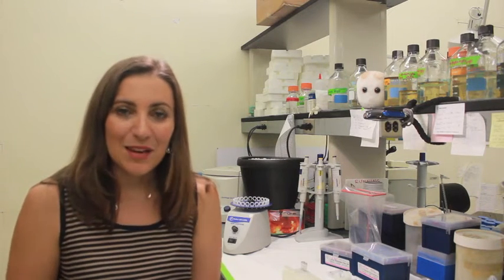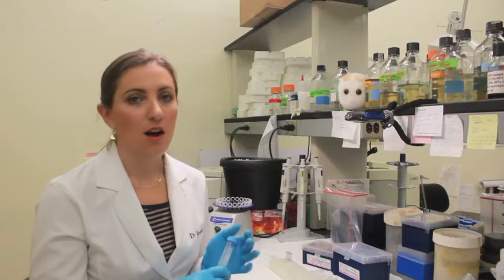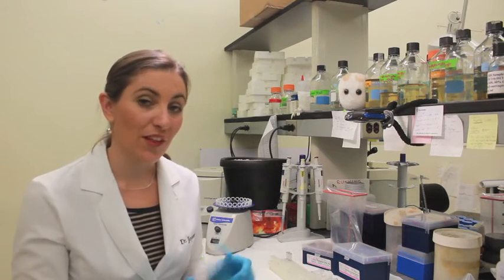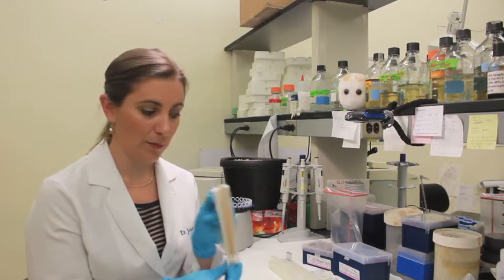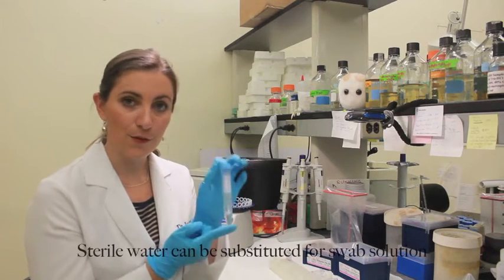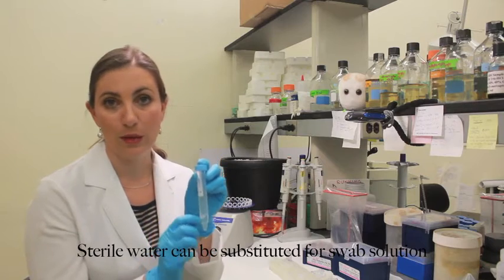So enjoy going out and sampling that urban microbiome. We are back and ready to sample our urban environment. For the sake of this video, we are going to sample the light switch behind me. Before we do that, we have our sterile swabs, our swab solution, and a 15ml tube with 2ml of swab solution inside.